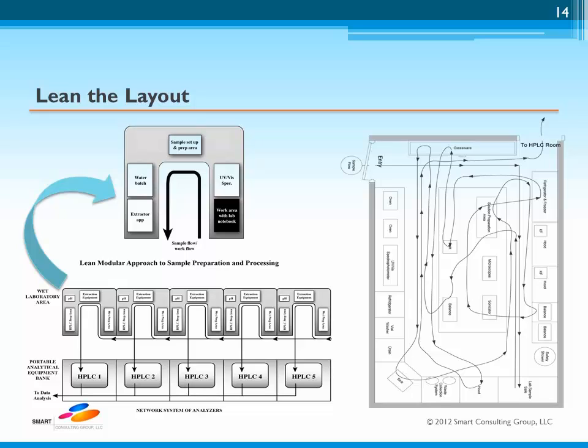Let's highlight these. There's a reduction in sample movement, which speeds up processing and reduces non-value added travel time. There's a reduction in travel time spent by the analyst moving station to station to process the sample. There's preparation and processing of samples, which leads to fewer errors or malfunctions as a result of fewer hands involved. The fewer cooks in the kitchen concept is highlighted in this respect.